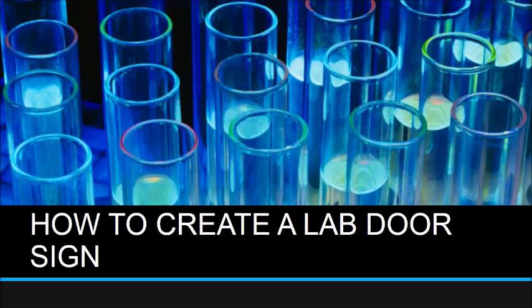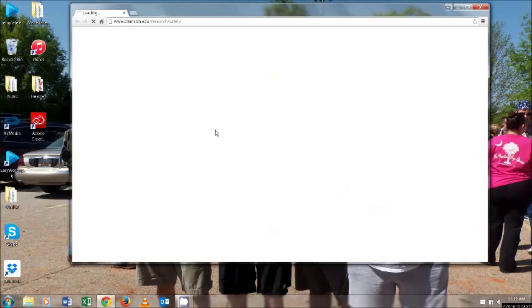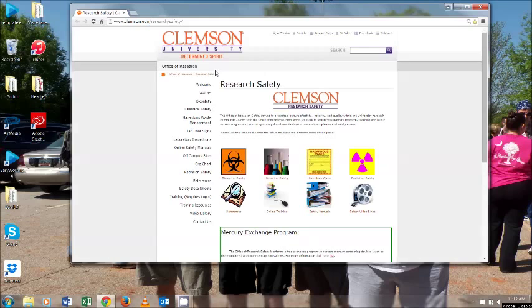This video is meant to show the user how to appropriately fill in and print the approved lab door sign for Clemson University. The first thing you'll need to do is open your web browser and go to the Research Safety website. The address is shown here.